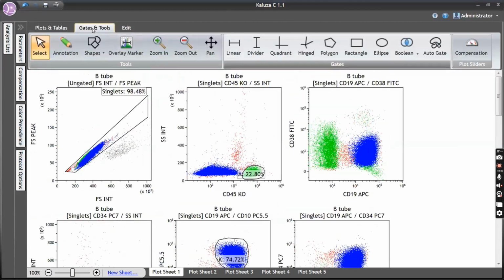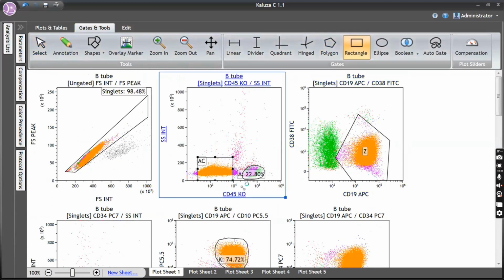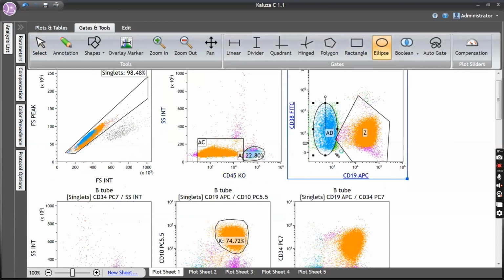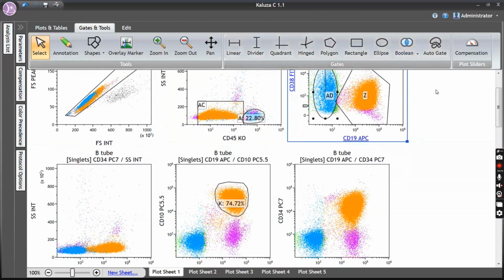So this is about the plots, and similarly gates. We have multiple gate types. One of the most common gates which I use is the polygonal gate, where you can draw a region like this. Okay, the other is the rectangle gate, where you can select the population like this as a rectangle. Then you have an elliptical gate where you can select the population like this. And Boolean is a gate where you give a command, that I'll tell you in the later part. Boolean is something like, if you want to include a set of events excluding some events, then you need to apply a Boolean equation.